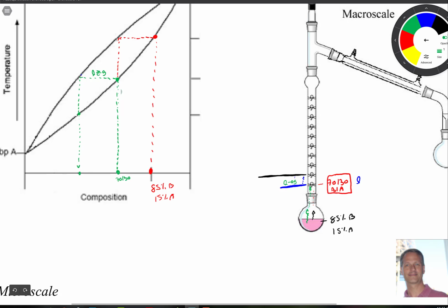And we'd call this, I think we call it 85-15 in our other example. So here we have 85% A, 15% B. And again, the numbers don't really matter, but we're more enriched. Okay, but we're not going to collect this. It's staying in the column. And now we have some liquid there.